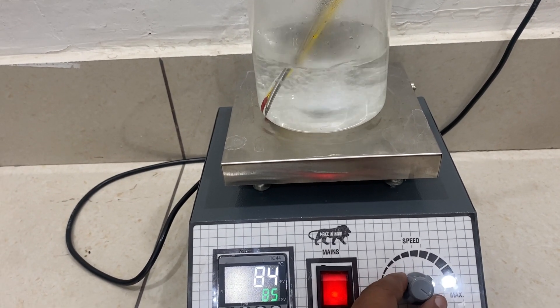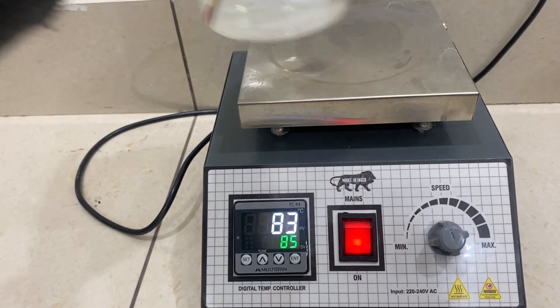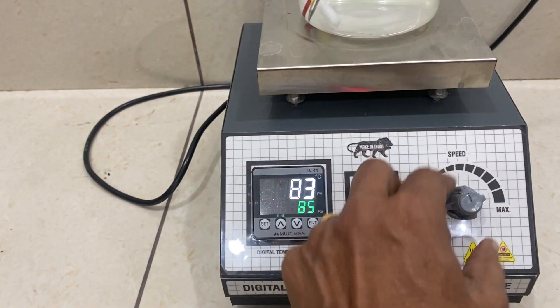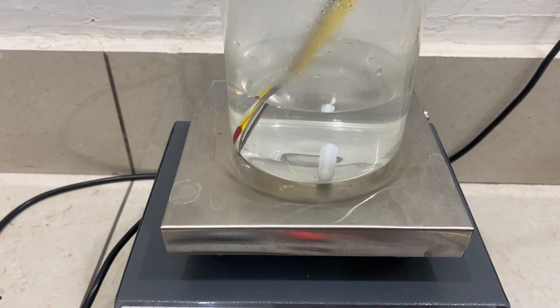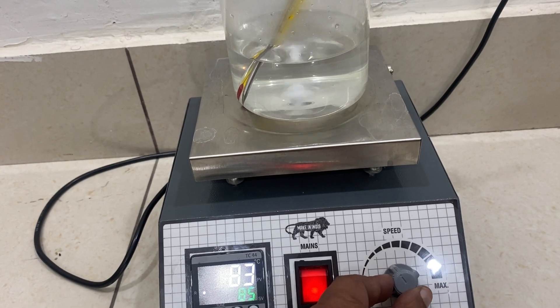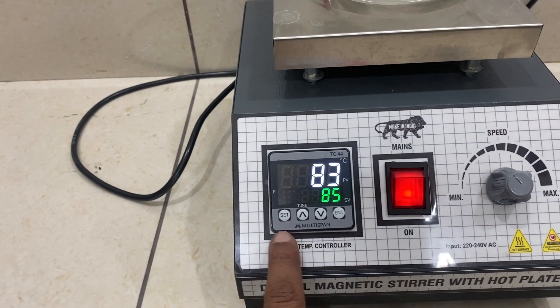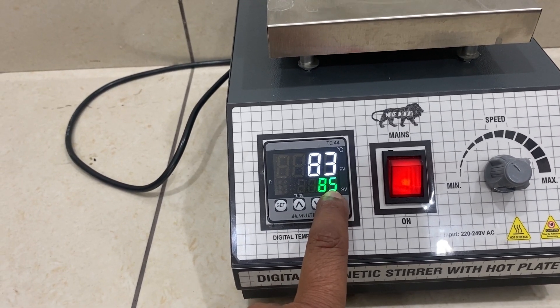At a higher speed, if you put it on and take it out and put it back, it starts jumping. So you have to stop it, make it zero, and then restart it. Then it will start stirring again.